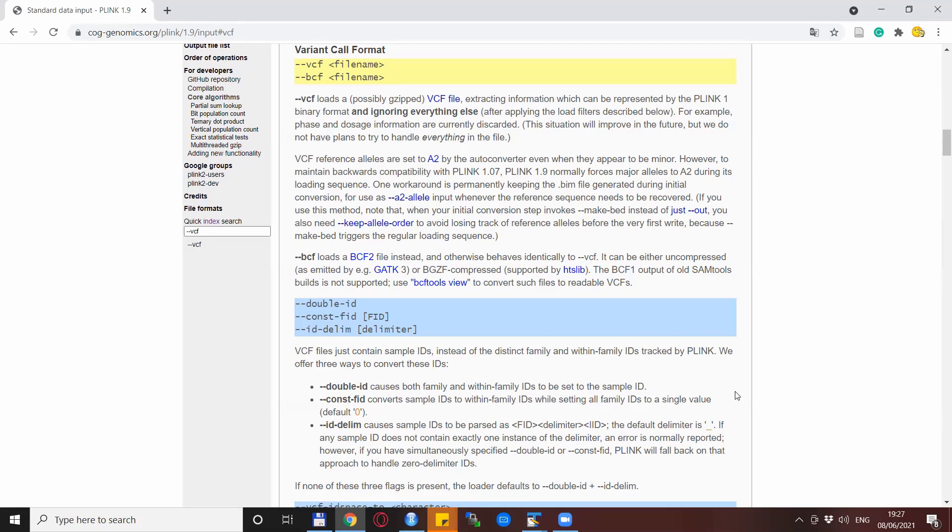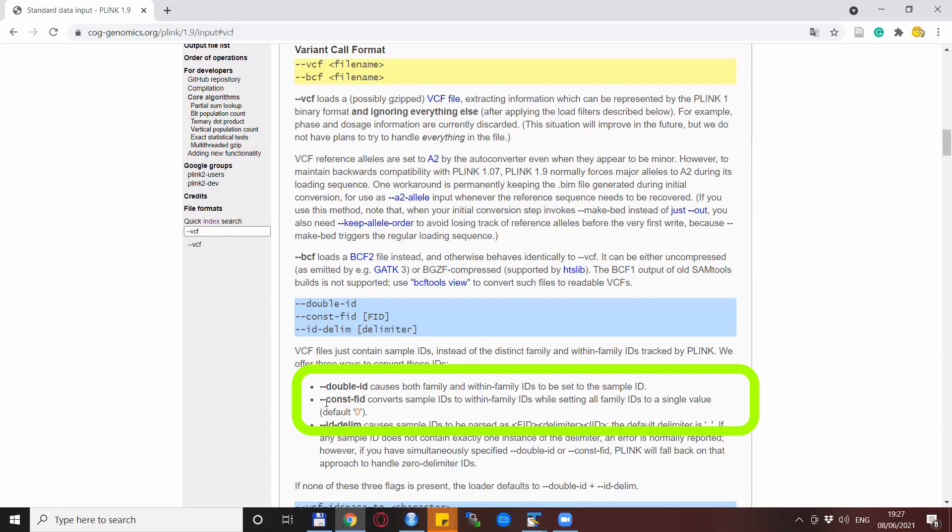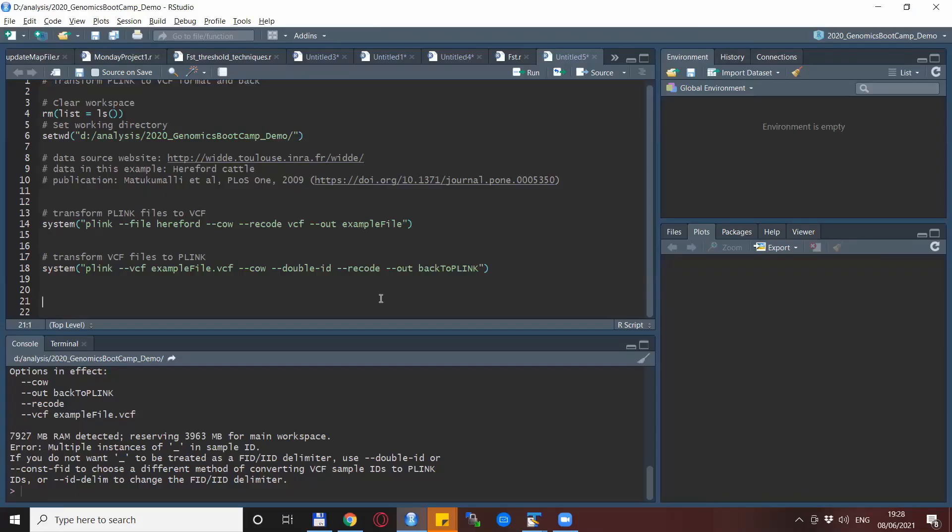So my very first suggestion, avoid underscores in your IDs for your individuals whenever possible. But if you happen to have underscores like in our case, you can just use one of the two very helpful Plink options to solve this problem in a quick way. And these two options are either double-ID or constant-FID.